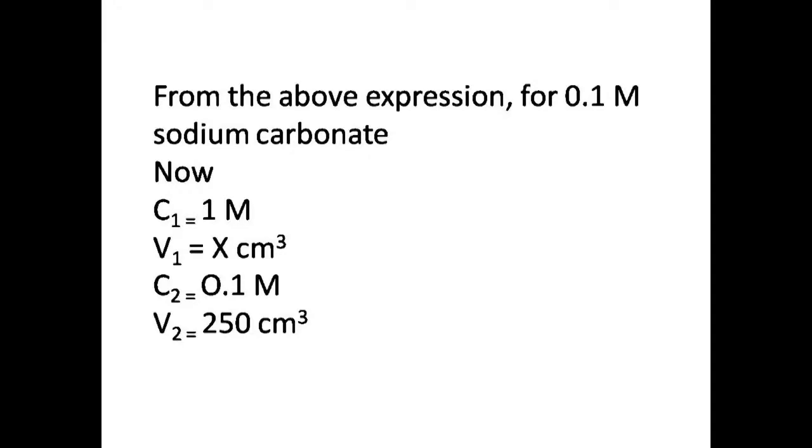V2 is the final volume, 250 cm³, because when we get our initial volume, we will dissolve it in deionized water, which is our solvent, to make 250 cm³.